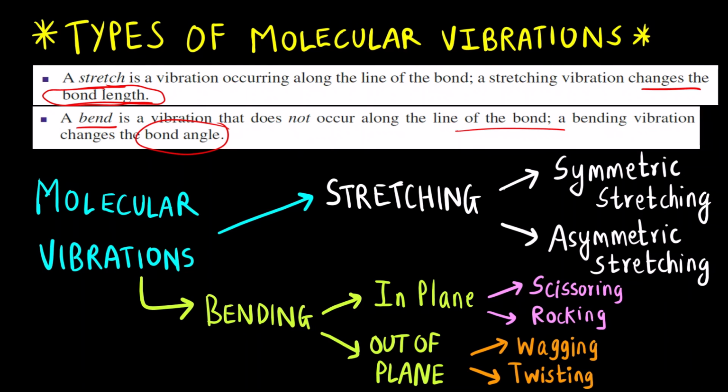I hope you have understood all the different concepts: the basic principle of infrared spectroscopy, and why we get inverted peaks. That is because of the percentage transmittance that we are measuring. It is the transmitted light we are measuring, not the absorbance. And what does the intensity depend on? The intensity of a bond depends on its polarity.